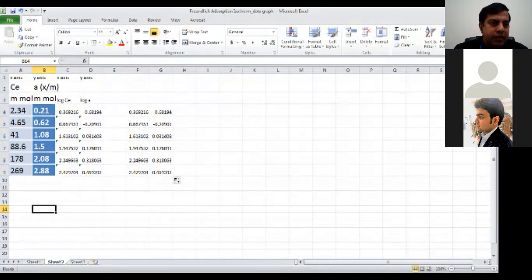The important thing over here is to plot a graph in Excel. This would be your x-axis and this will be your y-axis. The first will be the x, the second will be the y-axis, then it will give you the correct graph. If that's not the case, maybe you can just move them by copying on either side.